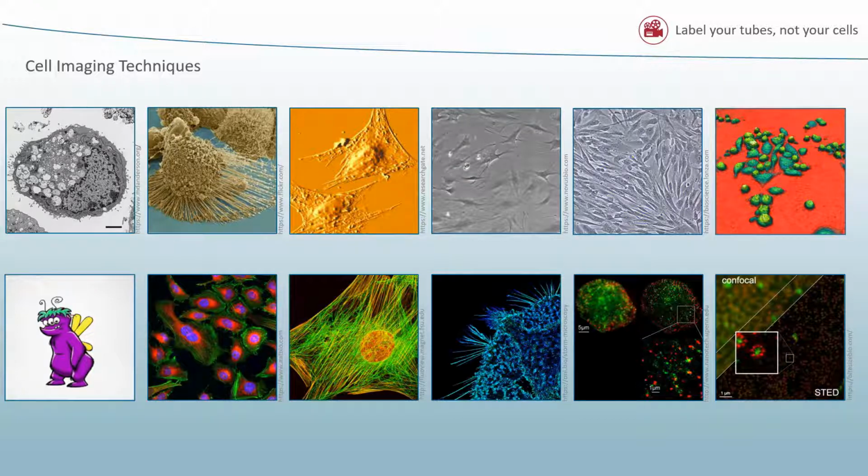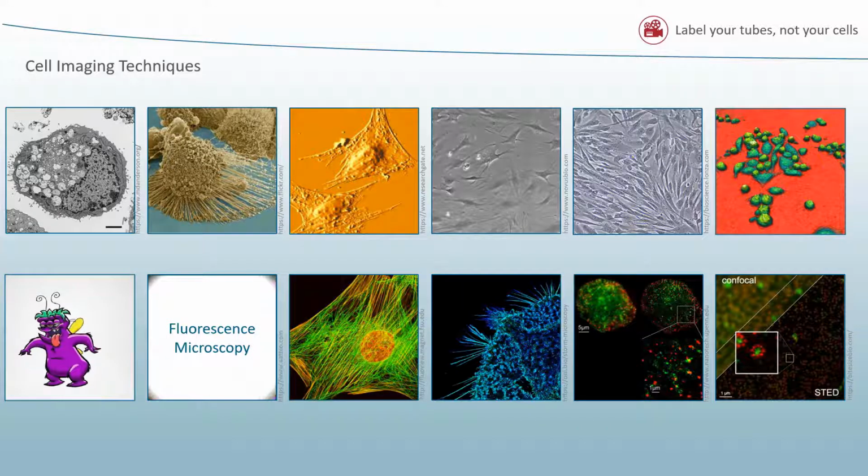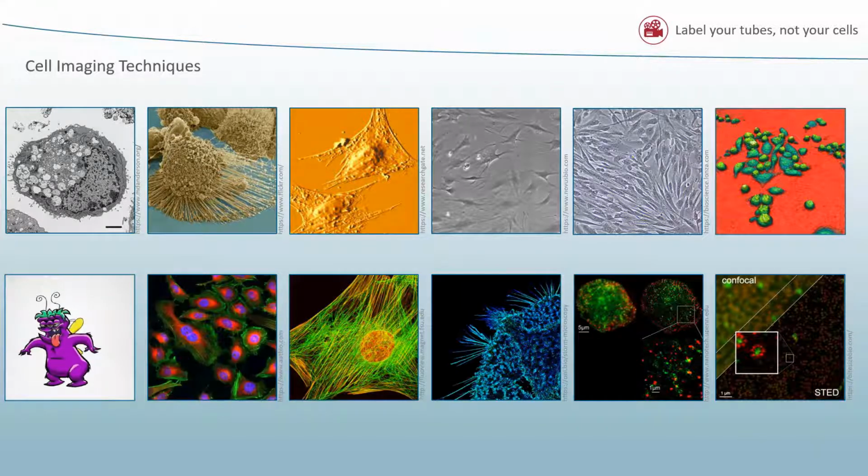So this is going to be exciting. This one is a bit tricky, but I guess you probably get it right. This is the little monster microscopy. Oh, what a funny face. The next one is fluorescence microscopy. Those colorful images are made by labeling the cells or the inner structures with fluorescence markers, and then you can see them.